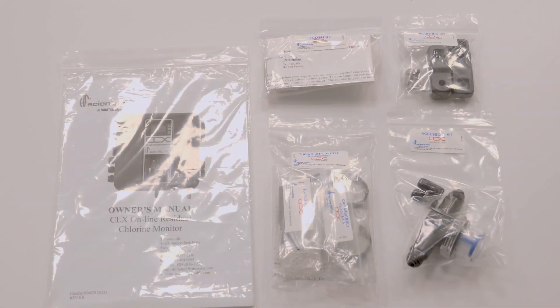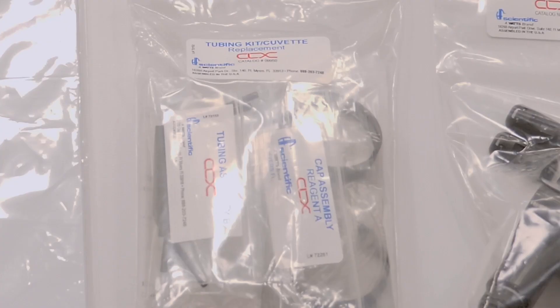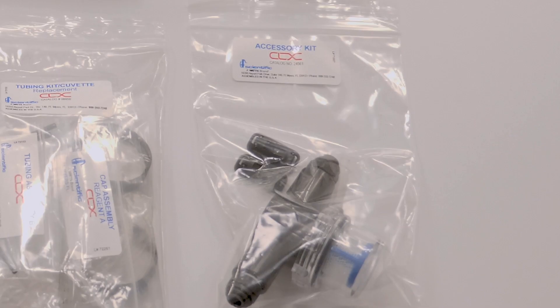When you receive your new CLX in the box, you will see the following items: the manual, the certificate of analysis, a flush kit, a tubing kit which includes an extra cuvette, mounting brackets, and a T-strainer.